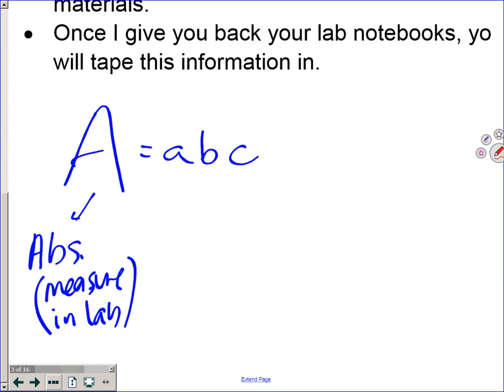In terms of what we're also measuring in the lab, but based on our own preparation of those solutions, what are we going to be preparing? Okay, so we have the brass. We're going to dissolve the brass. We're going to make a solution, and we're going to prepare it to a certain concentration. So we're going to have control over concentration, which we're going to use molarity today. The last time we did this, we used micromolar because we had very, very small quantities. But we're going to use molarity today.